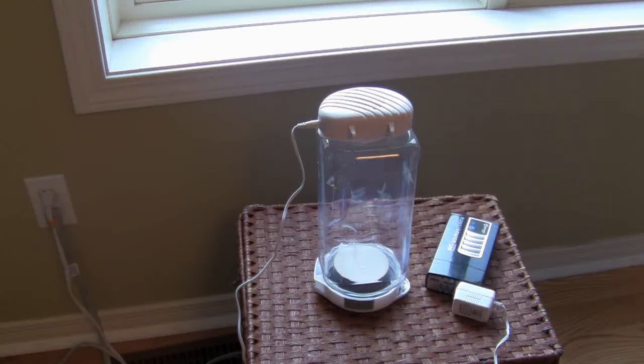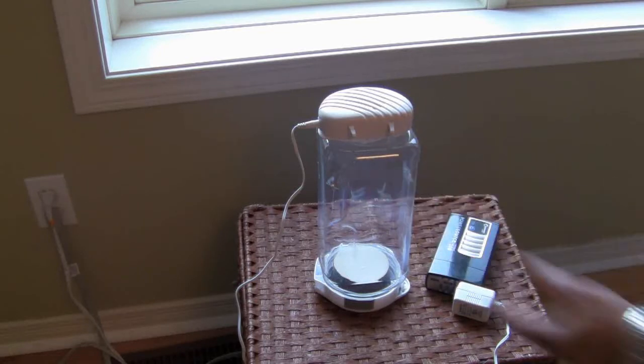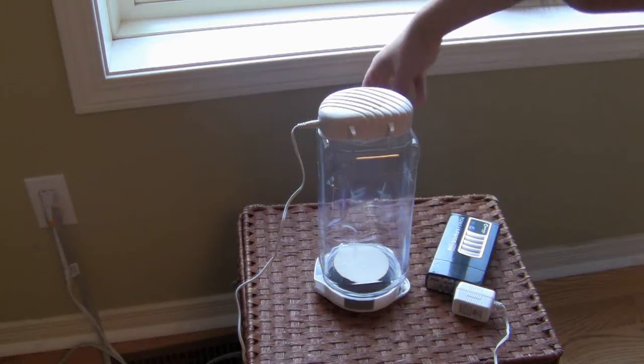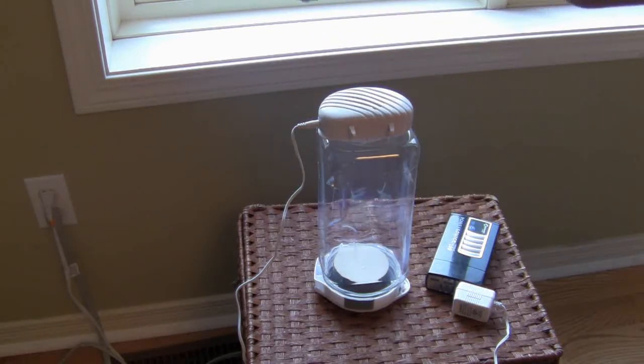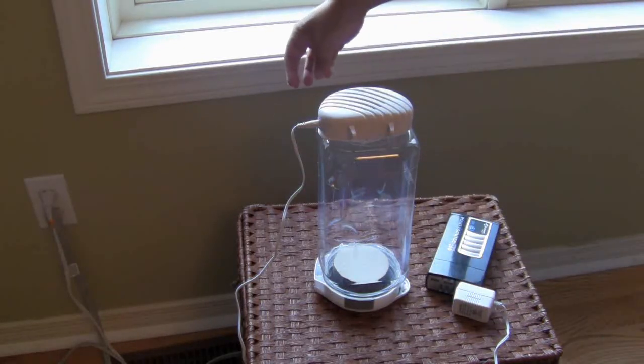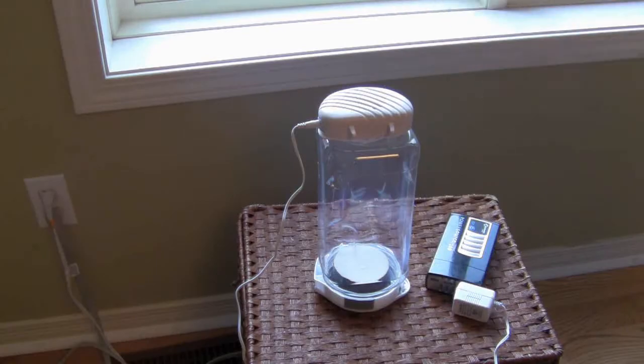Just use a very small amount of chemical powder — a couple of grams — and you can show that to your class. You might even want to install a camera so you can project the reaction to a projector, so the class doesn't have to crowd around and watch directly; they can view it from the camera feed.